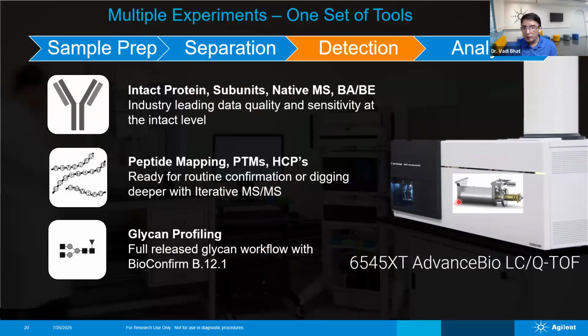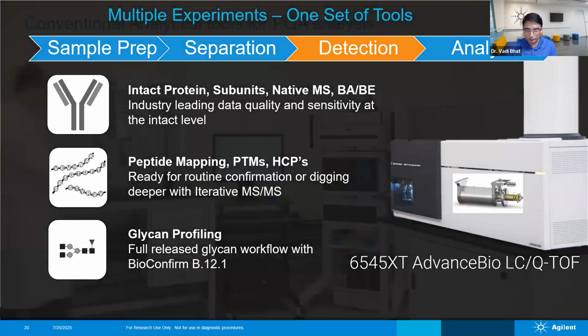Mass spectrometry also comes with different types of fragmentation capabilities, typically CID or high energy fragmentation, and nowadays all mass specs have that. People are also considering other types of fragmentation like ETD, ECD, or UVPD type capabilities. These can give different information and better fragmentation of fragile molecules like glycopeptides, or even let you do top-down analysis of subunits or the entire monoclonal antibody sequencing without any sample preparation.